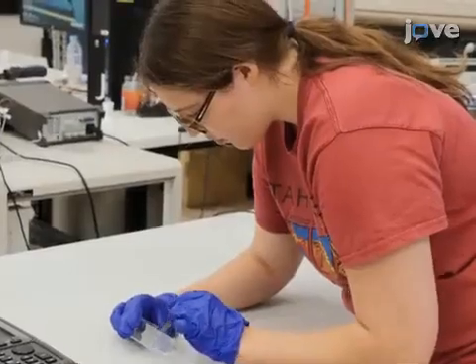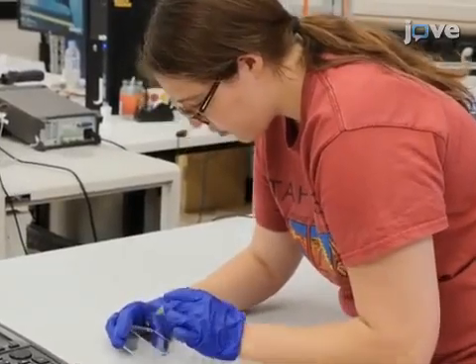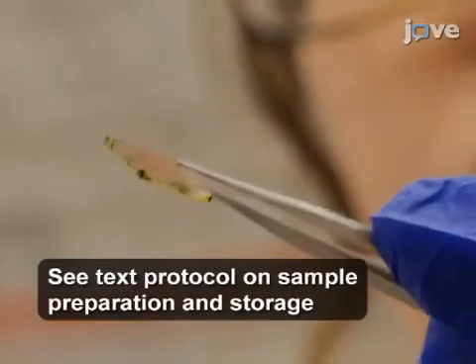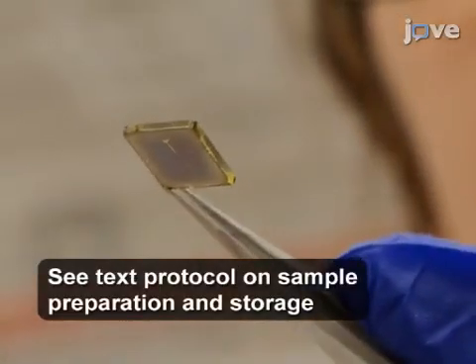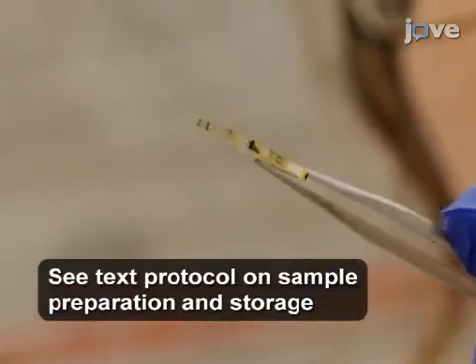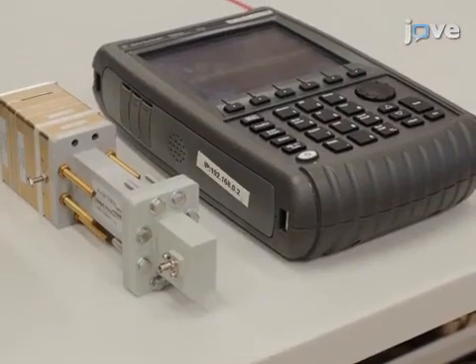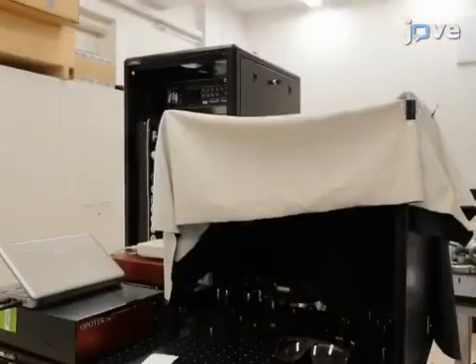First, gather some of the necessary elements to perform the measurements, including a prepared measurement sample. This thin-film perovskite sample has been characterized and its wavelengths of interest chosen. In addition to the sample, have ready a microwave cavity, network analyzer, and laser.